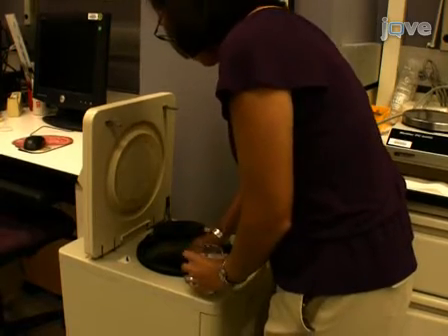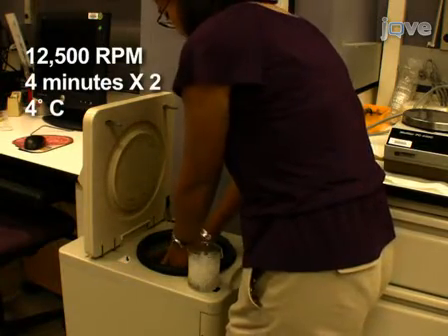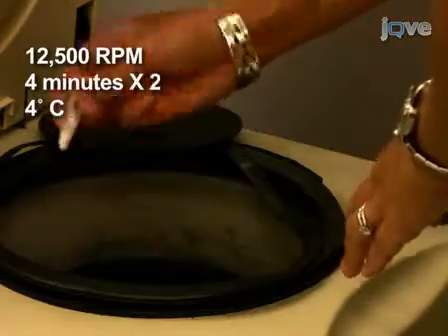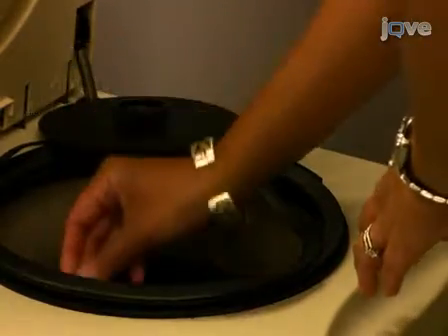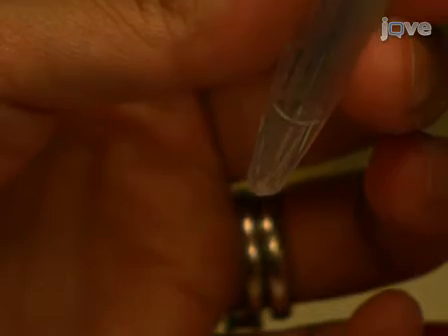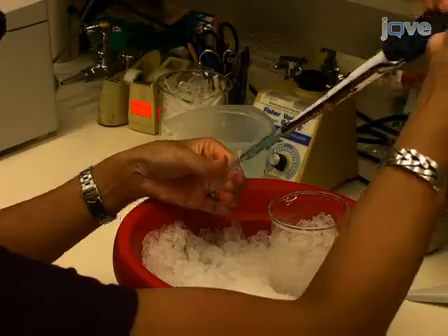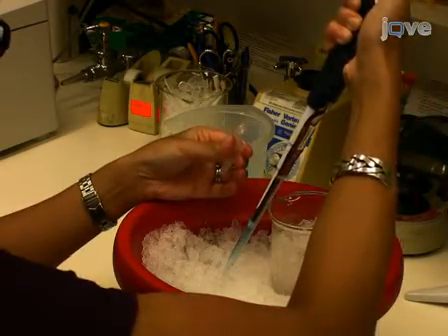Centrifuge the cell lysate at 12,500 rpm for two 4-minute spins at 4°C, gently inverting the tubes between spins to remove the loosely attached debris from the sidewall of the tube. Then carefully transfer the supernatant, without disrupting the pellet, from the two tubes to a new microfuge tube on ice.